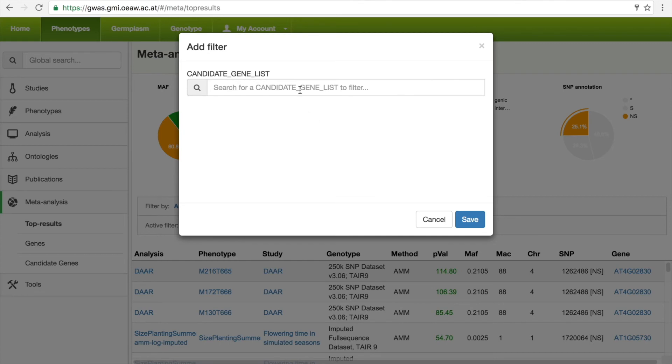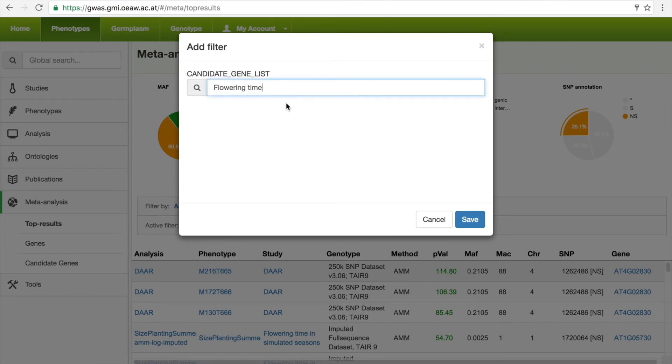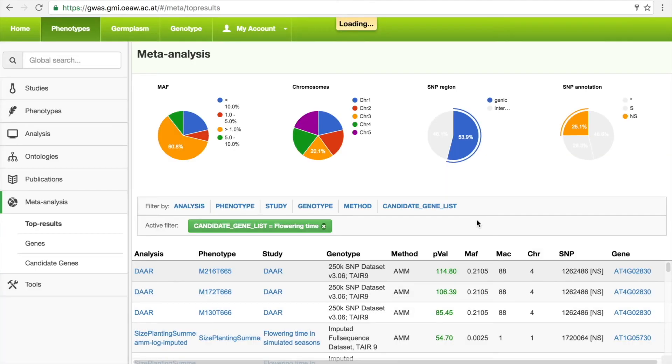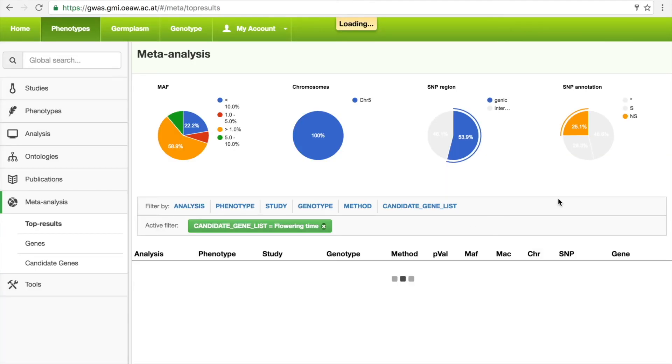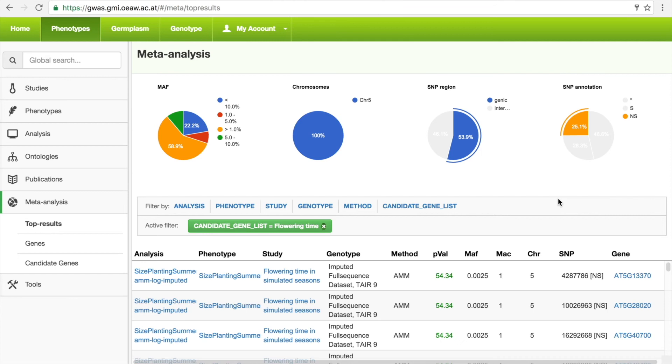Users might only be interested in specific genes, and these can be selected using candidate gene lists. By searching for flowering time genes, we can filter the list and only display associations within 20KB of any of the genes within this list.